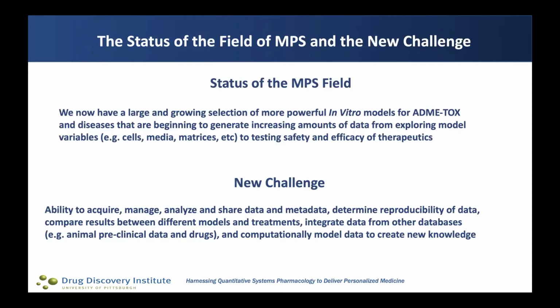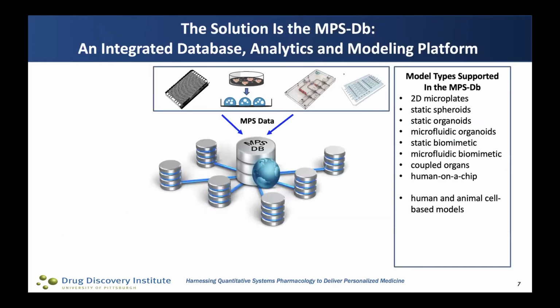So we now have this large and growing selection of different kinds of in vitro models that can be used. And one of the challenges associated with that is how to manage all of the data that's generated and then compare models, compare data, compare assays amongst all of those models. So that was the driver behind the microphysiology database.